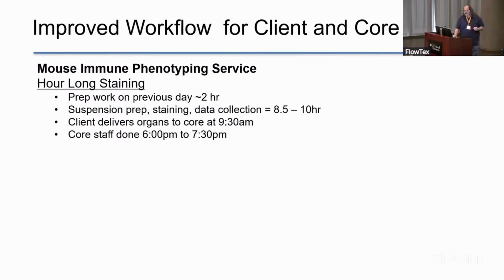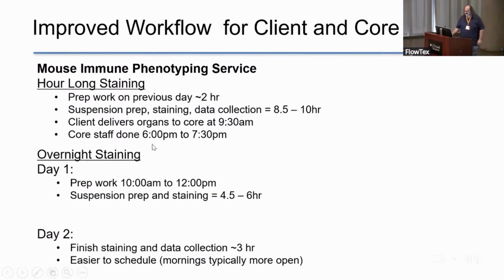However, now, if we do the overnight staining, we can break those days up. And so from my perspective, my first day is only 4.5 to 6 hours before I get to the overnight staining, and I can go home, take it easy. And I can actually do the prep work in the morning, like from 10 a.m. to 12, so that they can bring it in at around 12. And on the second day, it's a lot easier for me as a core person because I really only have to have like three hours to finish out the staining, just wash it out, and then do my data collection.